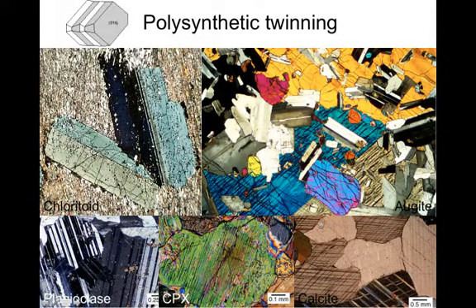I want to show you a few examples of some different features that you're seeing in the microscope that are tripping you up, perhaps. You've already seen several examples of twinning in plagioclases, for example, both Albite and Carlsbad twins. You've also seen some pericline twins, and maybe you've seen the tartan twinning in microcline. Here's an example too of similar polysynthetic twinning, that's parallel twins in a mineral like chloritoid, or you will commonly see it in clinopyroxene.